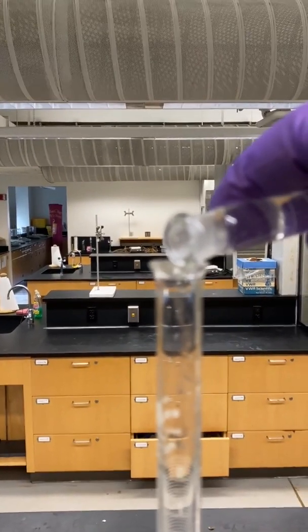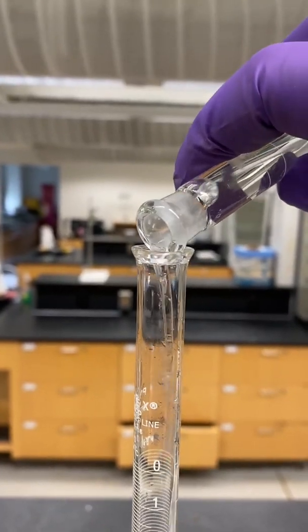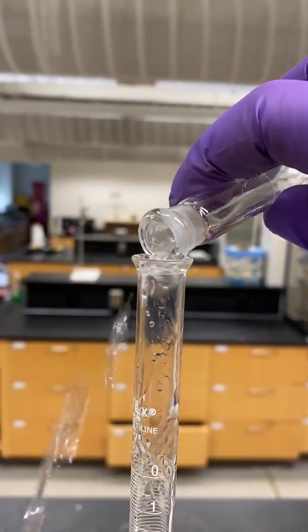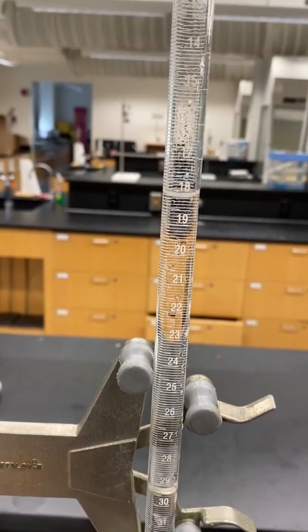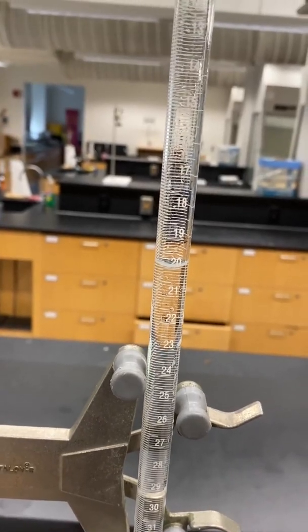Pour Stock 2 into a dry burette. Fill the burette above the 20-milliliter line and then drain some into the waste until you're right at 20 milliliters.